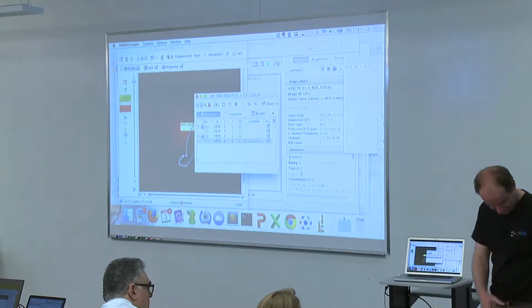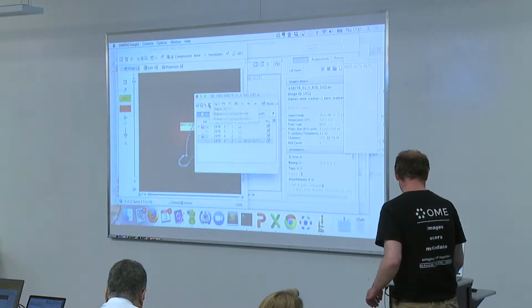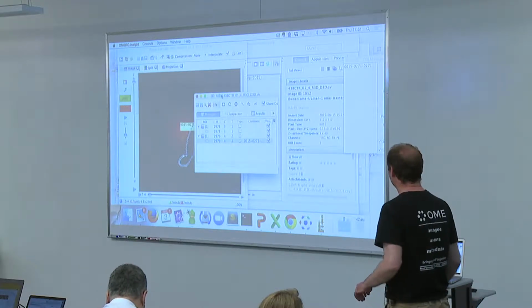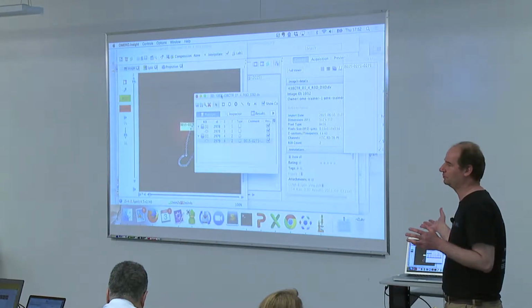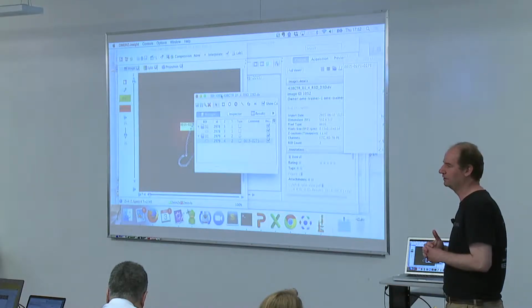Okay. Probably easiest. Thanks. So yeah, you can just delete the regions of interest here. And quite frankly, if you do get in a complete mess, you can delete all the regions or re-import the image into OMERO again from ImageJ. There is nothing stopping you there.